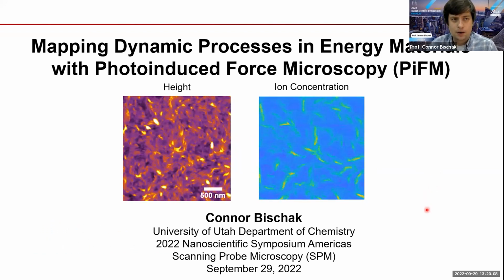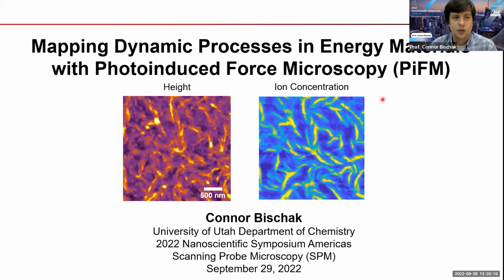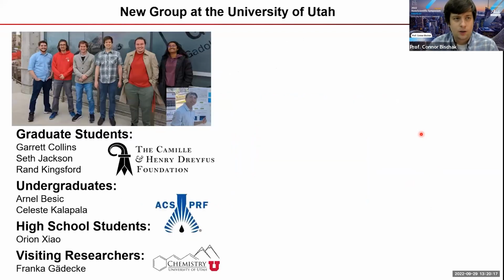But today I'm going to talk about mapping dynamic processes in energy materials with a technique called photo-induced force microscopy. But before I do that, I just want to acknowledge the people who did most of this work.